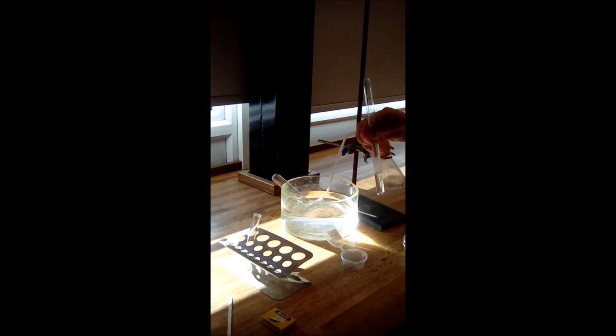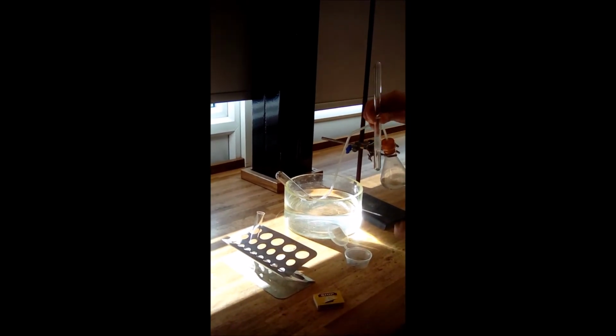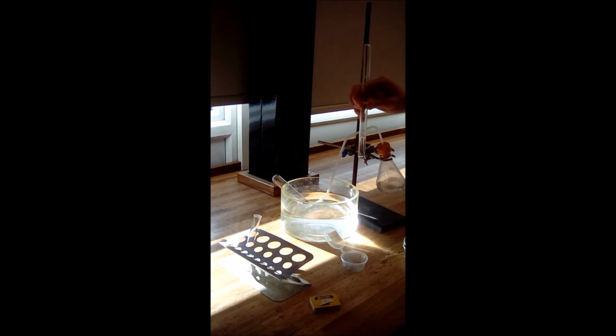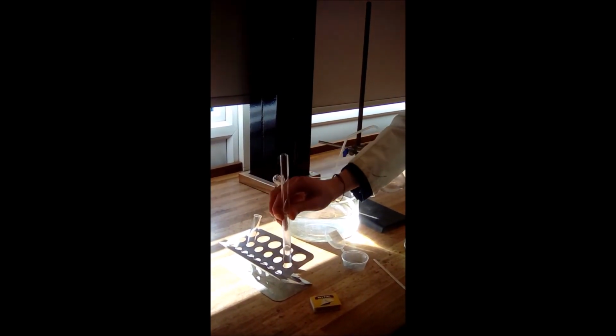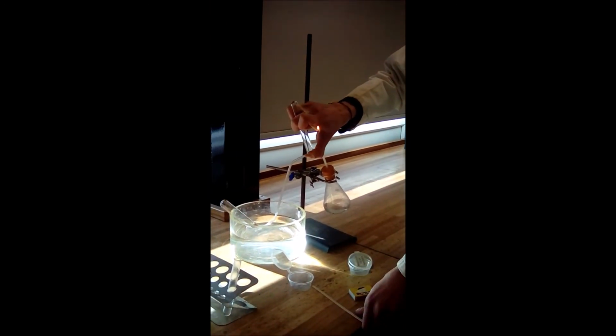So what I'm going to do in a second is I'm going to light a splint, and then I'm going to check whether it's worked by testing the gas in this test tube. So don't uninvert it, because then the hydrogen will escape. I'm going to put my finger on this here, and then I'm going to light a splint, which is easier said than done when you've only got one hand. Right, here we go.